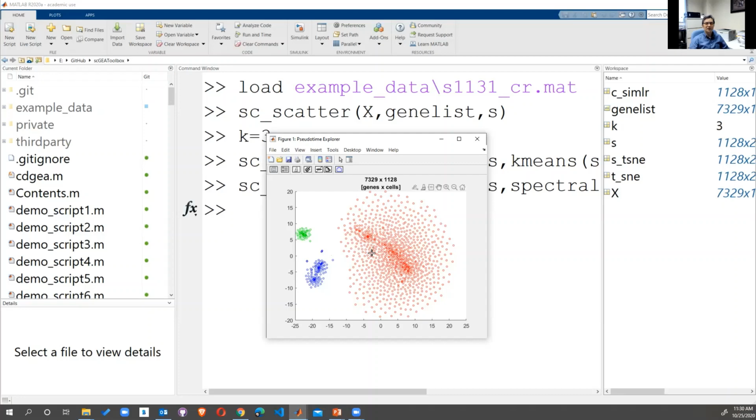So based on this assignment, you can start to detect what marker genes are expressed in this group, and in that group, and in this group. Then you will get the assignment of the cell type, because we have a database for marker genes. We know what genes will be highly expressed in astrocytes, and what marker genes will be highly expressed in microglia and other cell types. Once you have this clustering algorithm result and put the cells into groups, you can start to compute those specifically expressed genes specific to a particular group, and use that information to assign cell types.